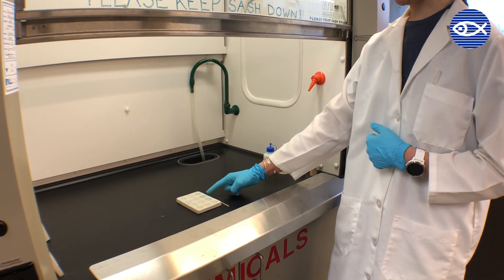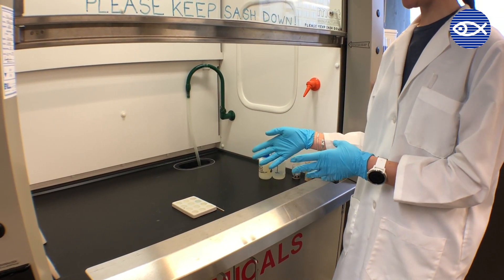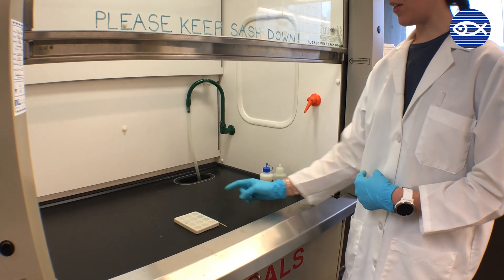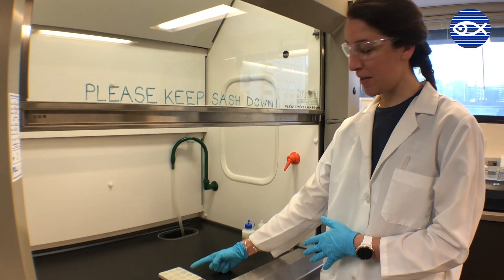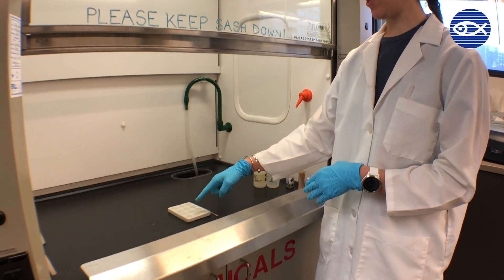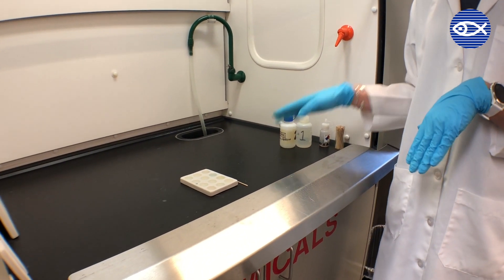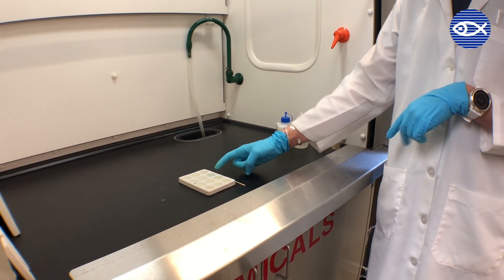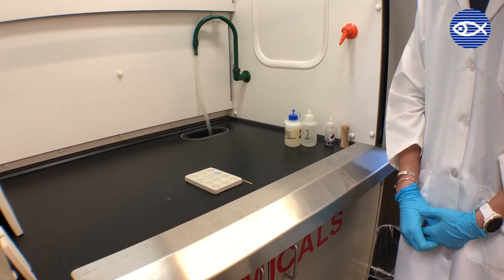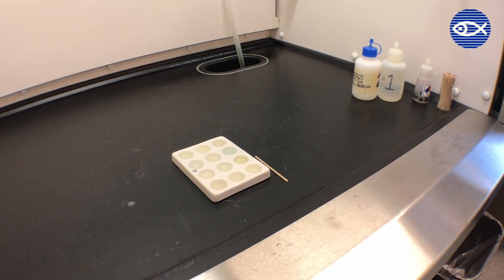This one right here is actually a bio seeding system right now, so they're actually adding ammonium chloride into the system to help feed the bio filter. So that's a good example of a very positive system. Then like these ones over here, since they're more grayish lighter color, those ones are negative so we won't test those. I'll only run this one on the 15 to 20 minute test. So it's just a way for us to save our time, do time management, and I'm still able to check all the systems at once.